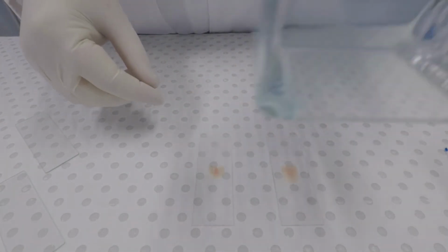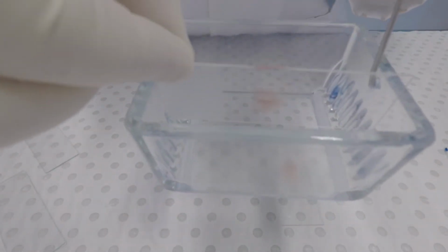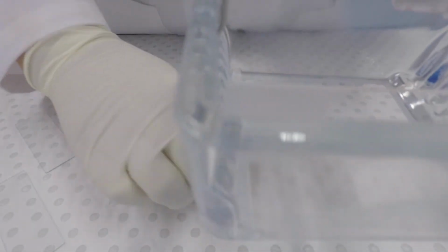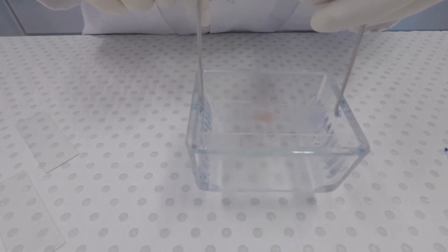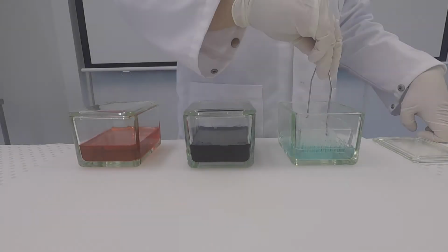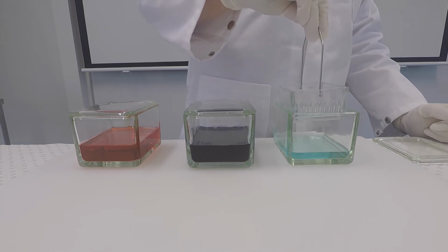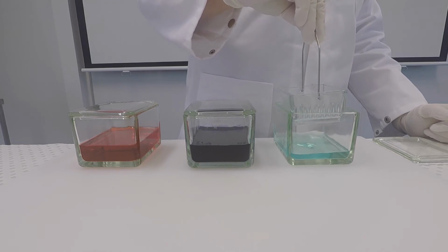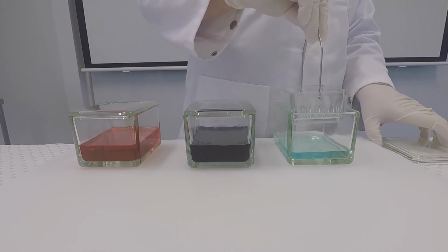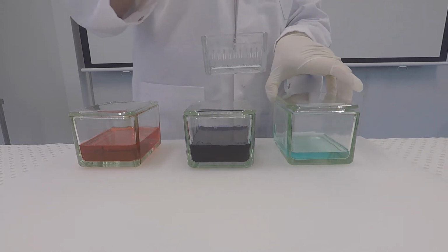So our slides have dried now, and we need to put them in the staining rack in preparation for staining. Today we're using a commercially available staining kit called DiffQuick. The first stage involves dipping our slides in fixative solution, which is light blue in colour. This ensures that our cells stick to the slide and are not washed off during the staining process.